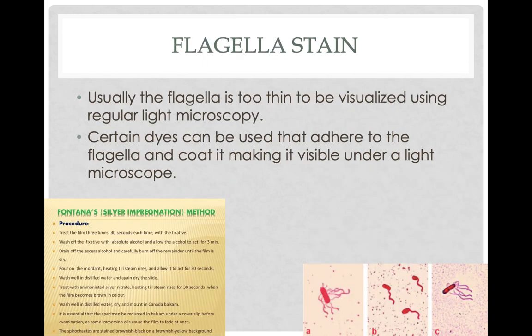Flagella stains. If a bacteria has flagella, you might want to see that, to see how many they've got. So you have to use a specialized stain that can stick to the types of proteins that are found on flagella.